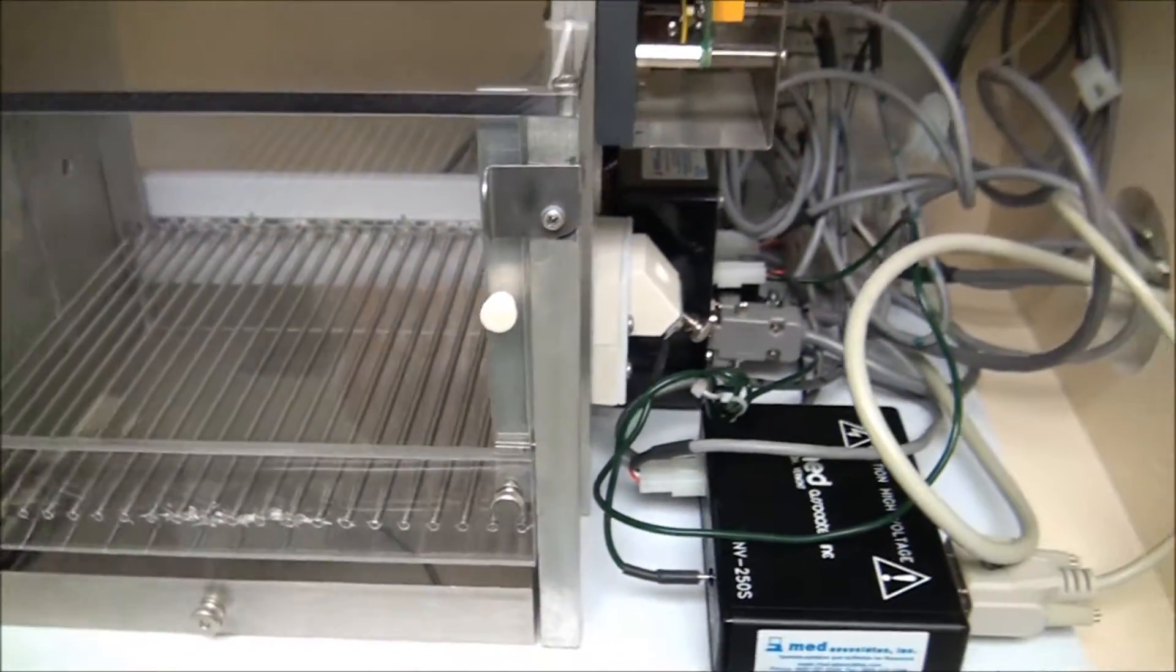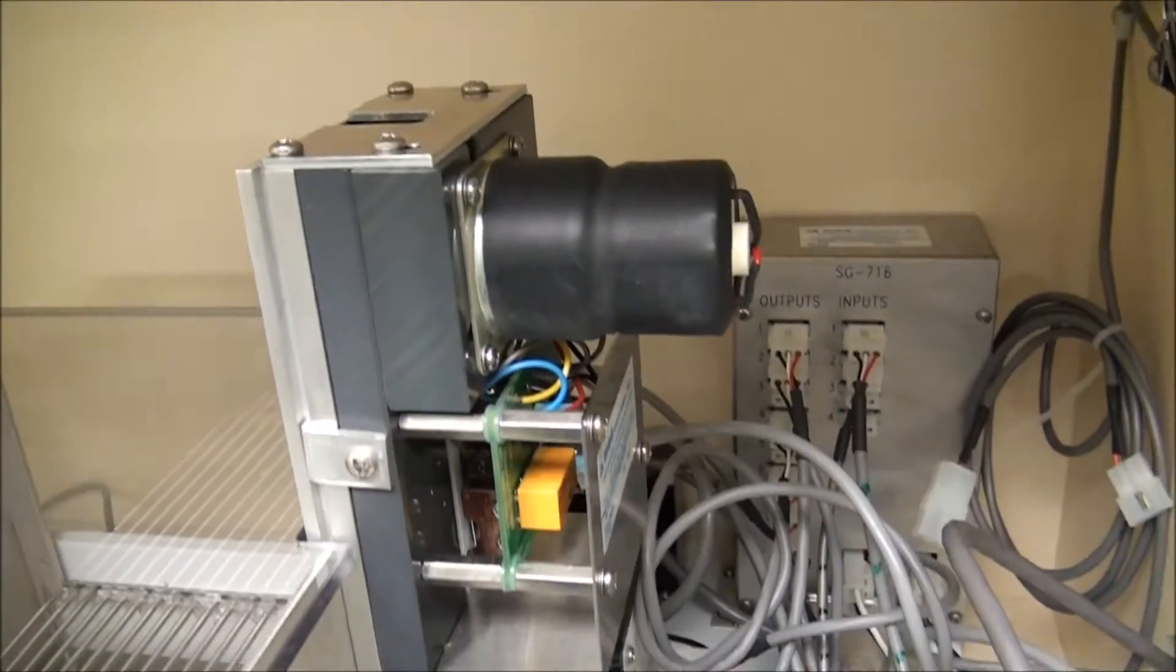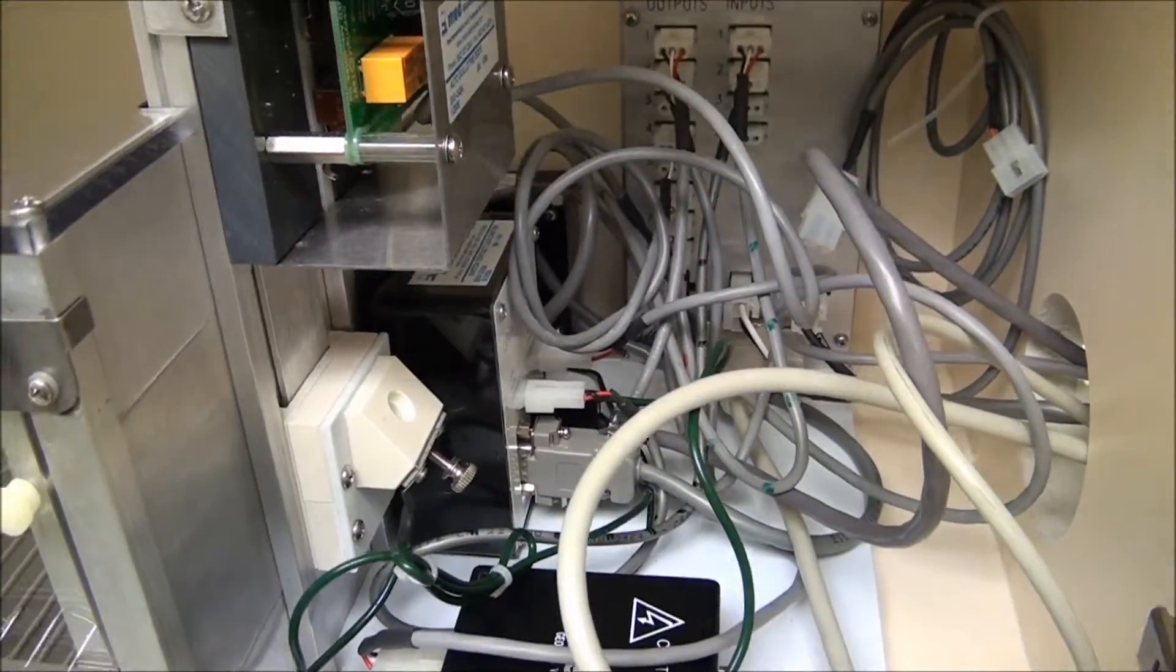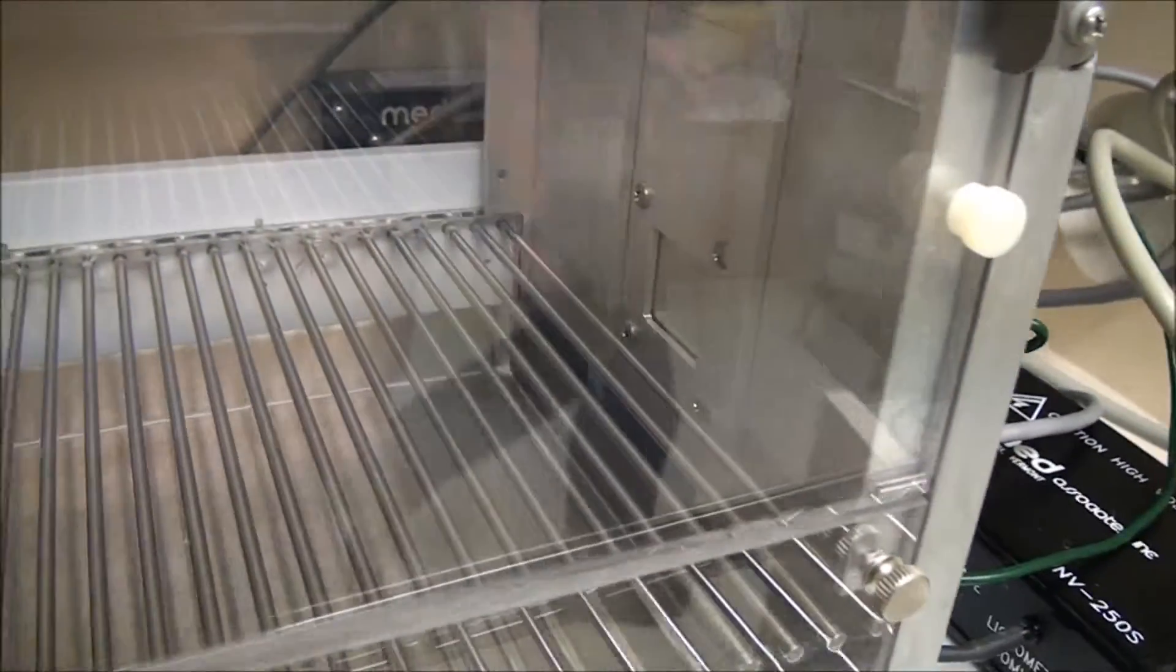But you're getting all of this in this system. And then also you can see the guillotine door here. It's also an output on this unit. You can see the guillotine door is shut here.